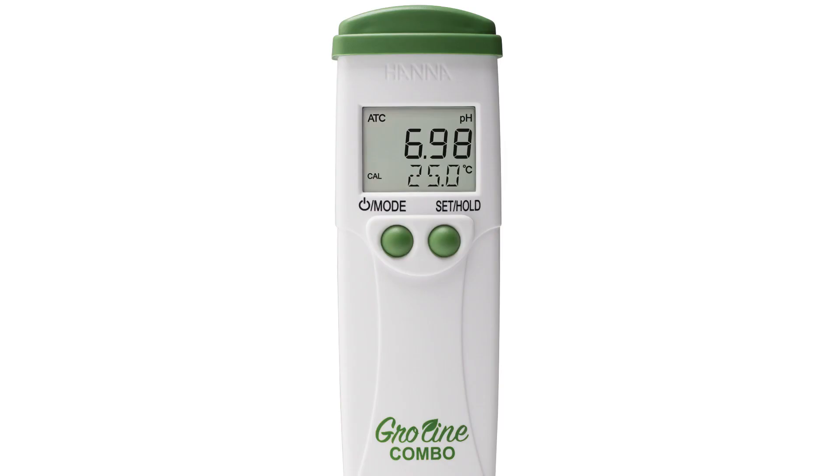To set up your tester to your preferred settings, press and hold the mode button for six seconds until you see the unit of measurement. Press the set hold button to choose between EC measurement or TDS factors of 0.5 (500 ppm) or 0.7 (700 ppm).